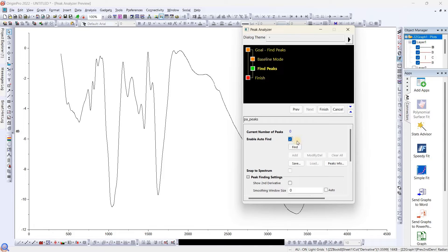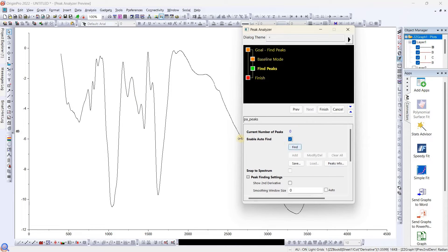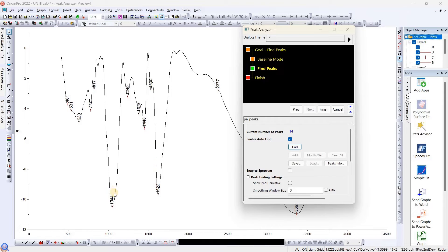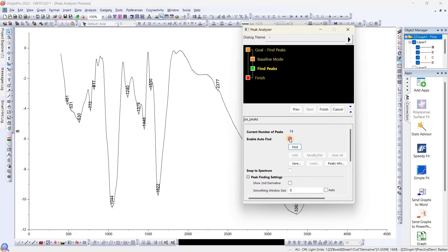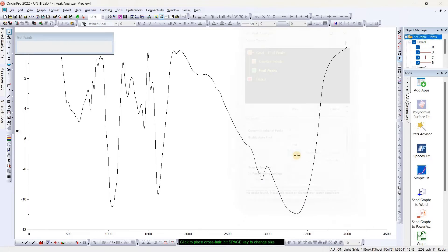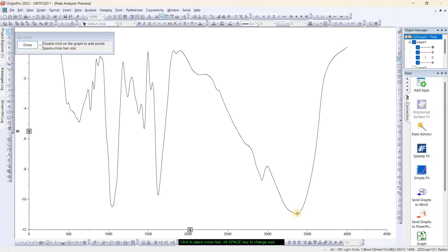Here there are two processes. One, they can automatically find the peak. Once we click, they have found every small ripple also. They selected everything. We don't want that. We want particular selected peaks only. For doing that, we have to enable this and then clear all the peaks they have found.